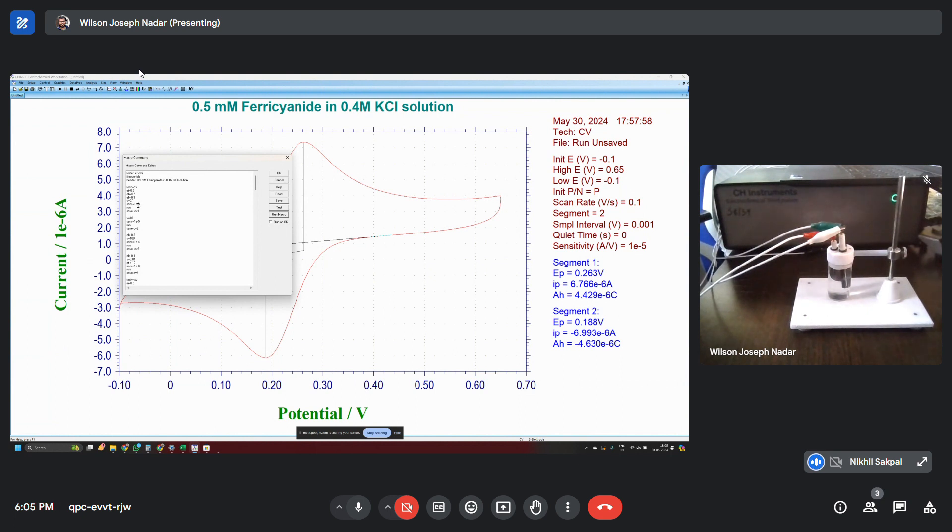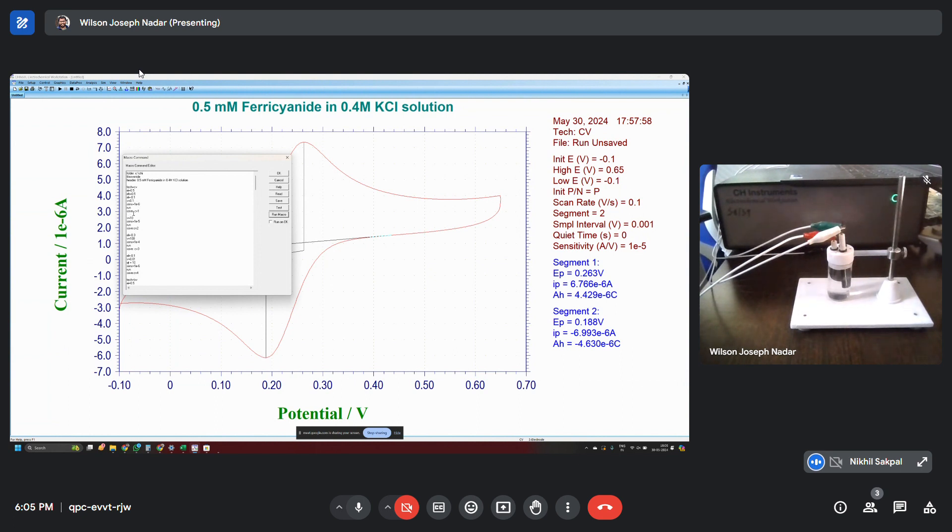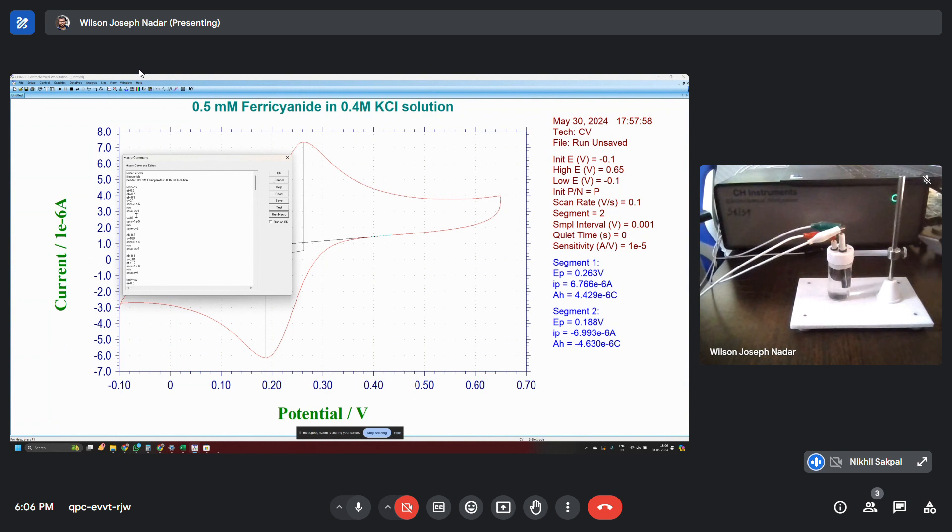Then run. Run means after setting all of these parameters, it will run the parameter with respect to the defined parameters on the top. Now save CV1. Save CV1. Save colon space CV1. This CV1 will be the name of the file that will be saving this particular CV.